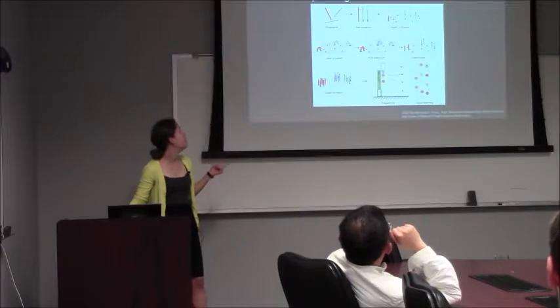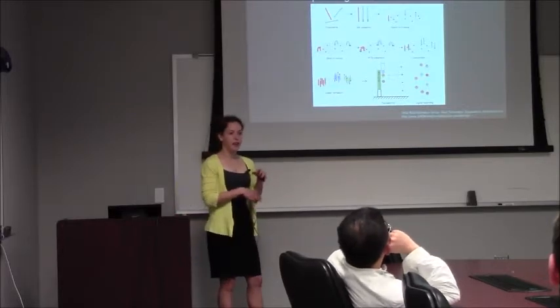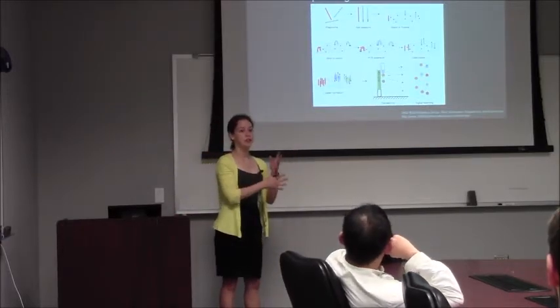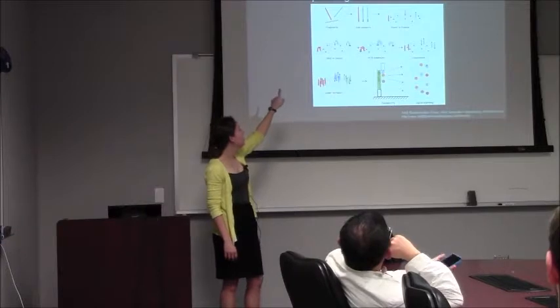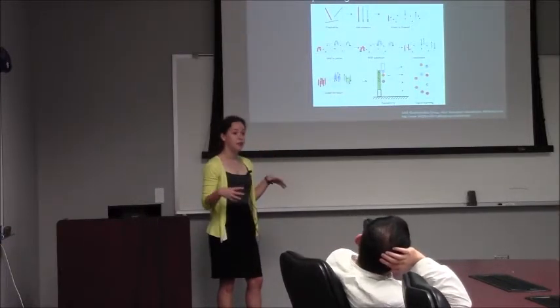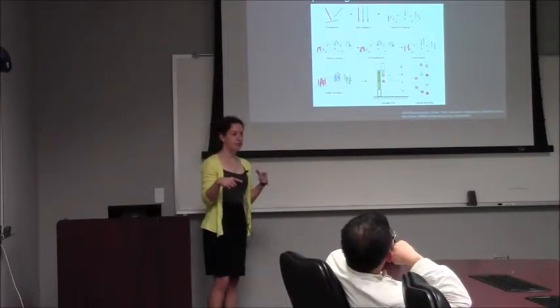So Illumina, which is a common sequencer, goes through this process. And the key thing is that RNA isn't sequenced all in one strand. They break it up into a bunch of little pieces and then sequence each little piece. So you have all these fragments of your genetic material, and then they add adapters so that you can stick it onto a flow cell inside the machine.